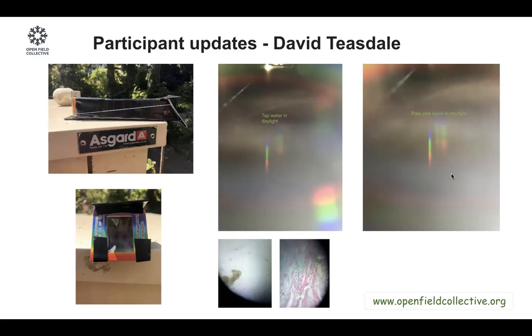And that way you can compare them and find out exactly what wavelength was absorbed, and then try to come to a conclusion as to what there was which absorbed that band. That's the analysis that we will do on the back end once we have a lot of this data coming in.